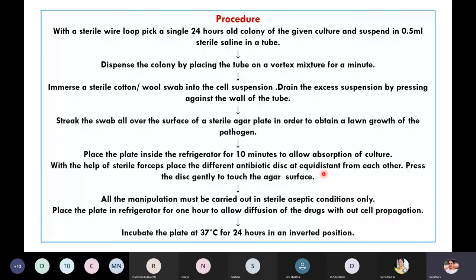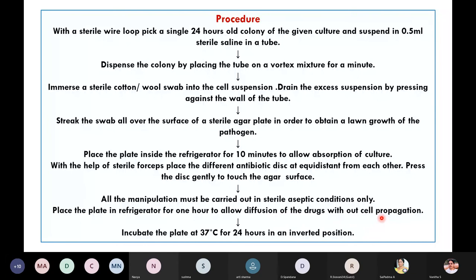When the discs are placed, they will be labeled. With the forceps, give a gentle press on top of each disc so it will attach to the surface of the agar. Now place the plate in a refrigerator for one hour to allow diffusion of the drugs without cell propagation. At low temperature, the organisms will remain quiet while the drug diffuses into the media. Once one hour is over, transfer the petri plate to the incubator preset at 37 degrees centigrade for 24 hours in an inverted position.